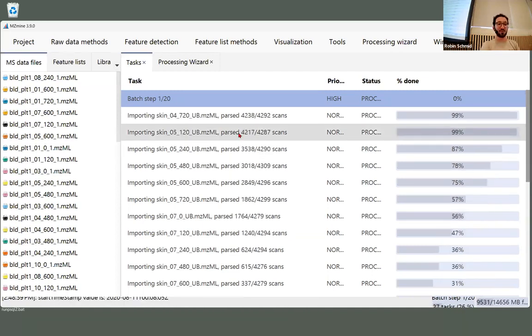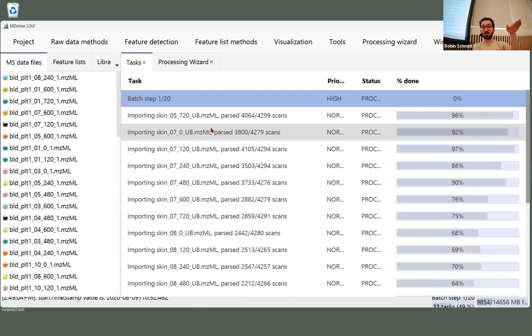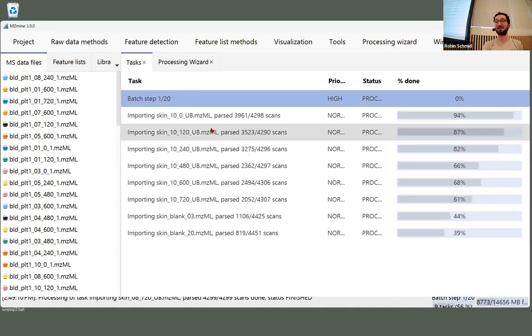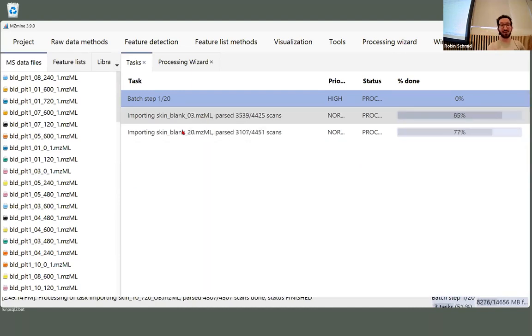It's a lot of data to parse and to import, but we handle it in a way that we offload stuff to temporary files. And as long as you have enough fast SSD storage or something, it goes very fast. You should not care about it. And so you see, it already takes a bit longer, right?